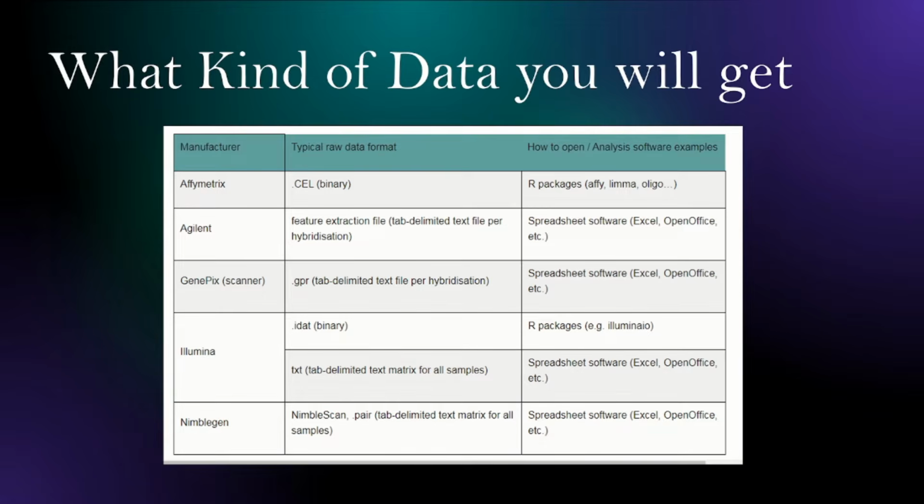If you see the output or raw data from a gene expression experiment, it is actually the starting point for all the downstream analysis. These data files are generated directly by the instrument during the hybridization or sequencing process, and store the intensity values or counts representing the gene expression levels.